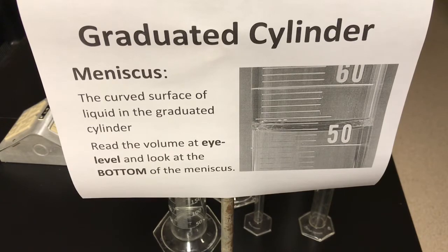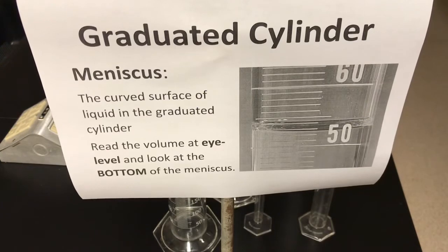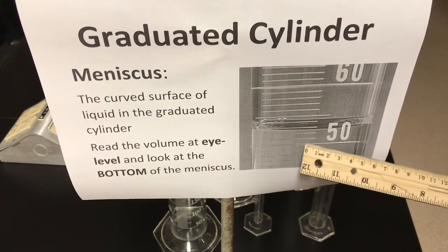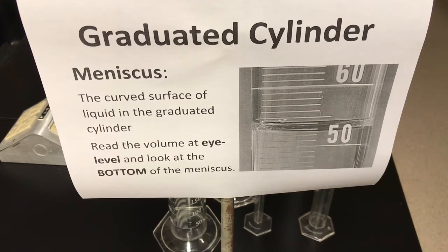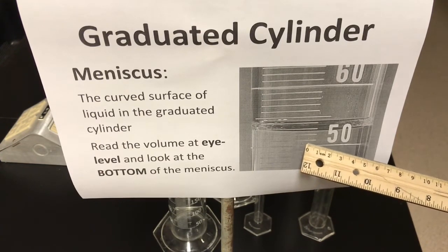Graduated cylinders come in many different sizes, and you'll see different scales on them as well. On the one in the picture, we can see 50 and up here 60, so this goes up by 10 milliliters — we refer to that as the major scale. Between 50 and 60 there are 10 little spaces formed by those graduations, and each of those spaces represents the minor scale. So you take the major scale of 10 milliliters and divide by 10 spaces: 10 divided by 10 is 1 milliliter. So the minor scale here is 1 milliliter — each tick mark represents 1 milliliter.